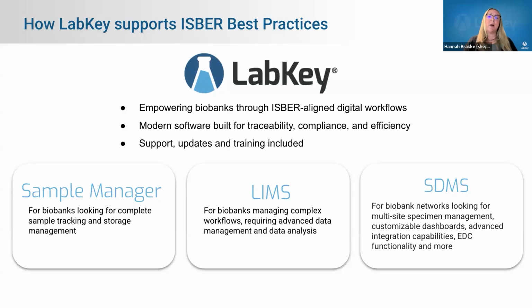LabKey LIMS supports everything that Sample Manager has, but then also goes a step further and allows groups to manage more complex workflows, test data management and analysis, and an electronic lab notebook for researchers who need more from the system and more centralization rather than just the standard specimen and storage tracking.